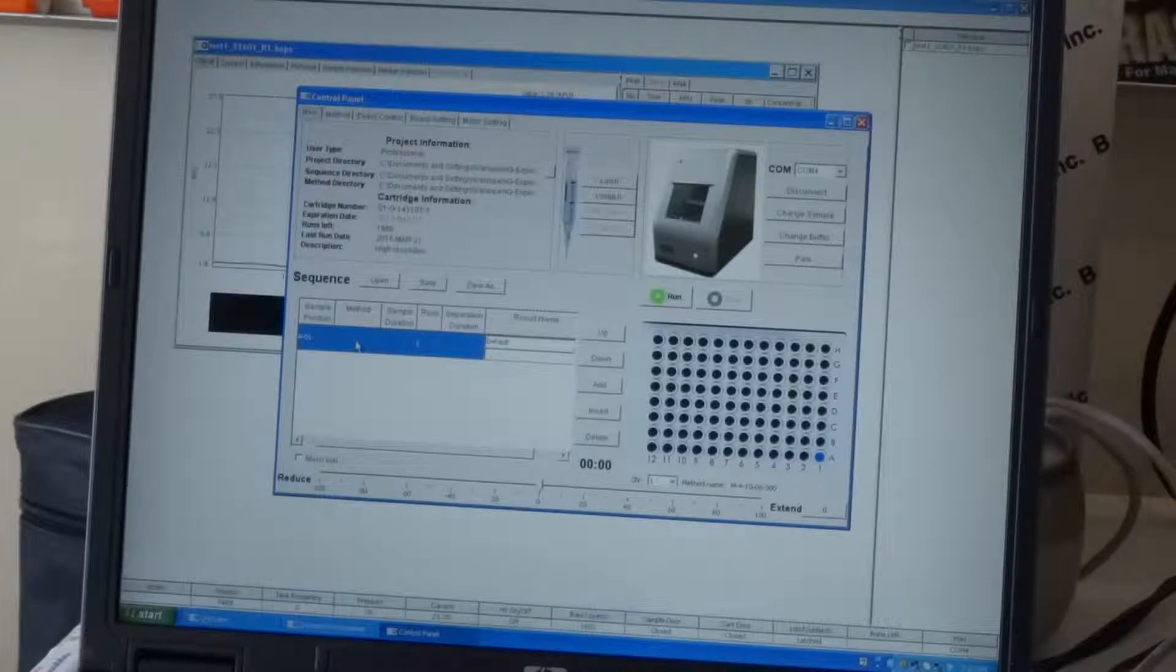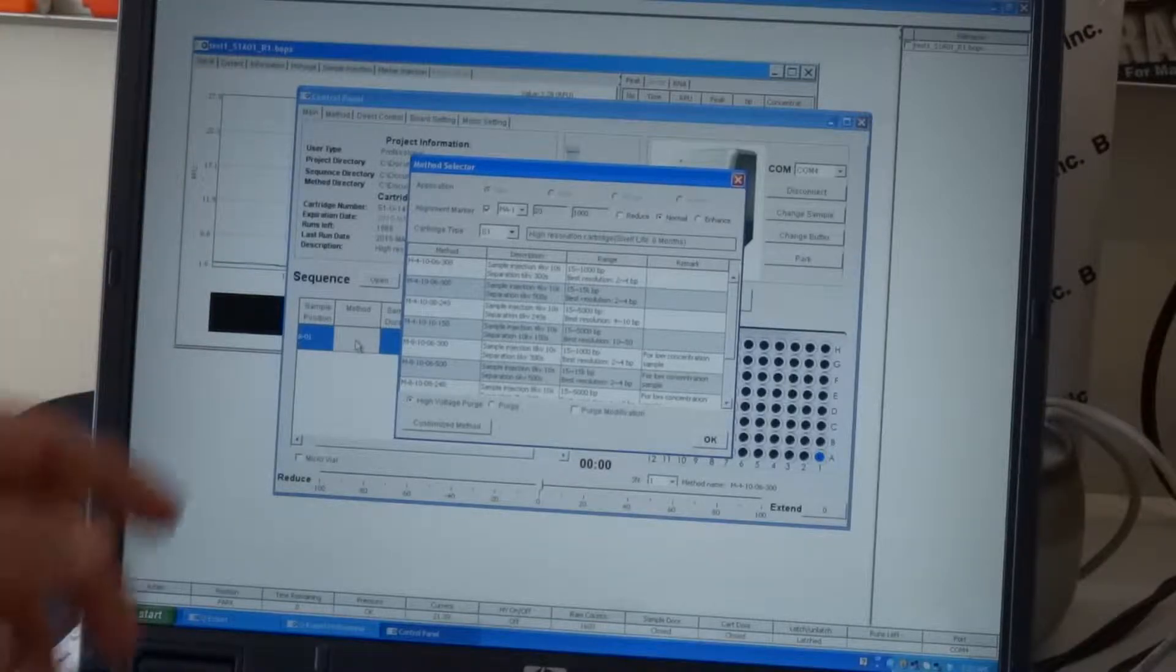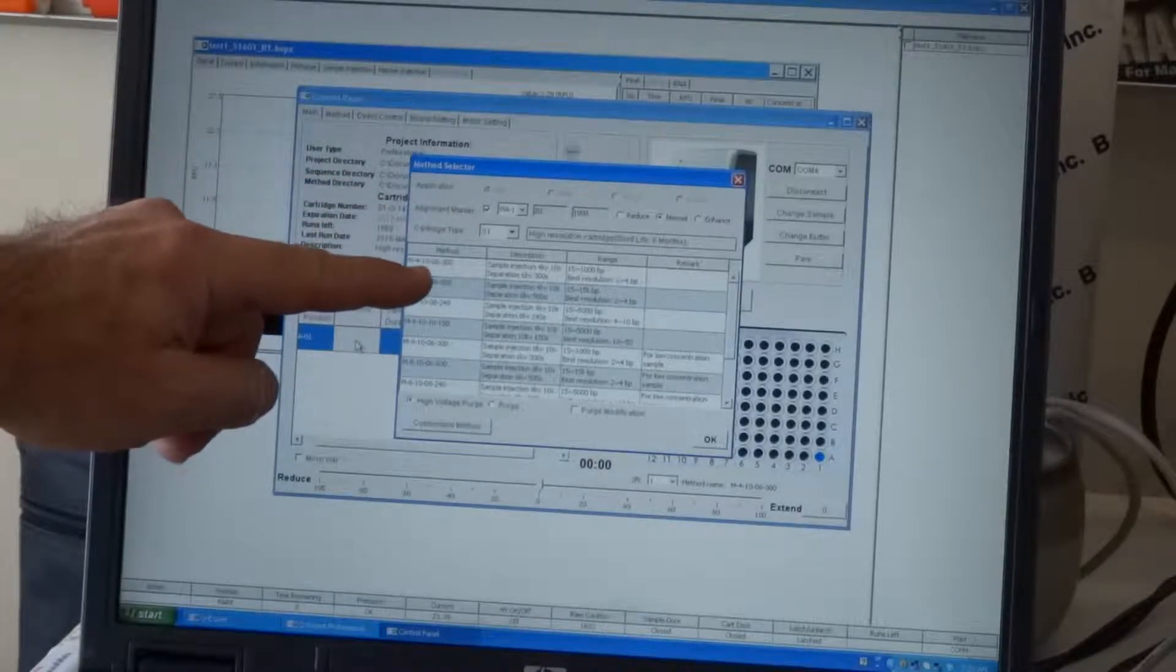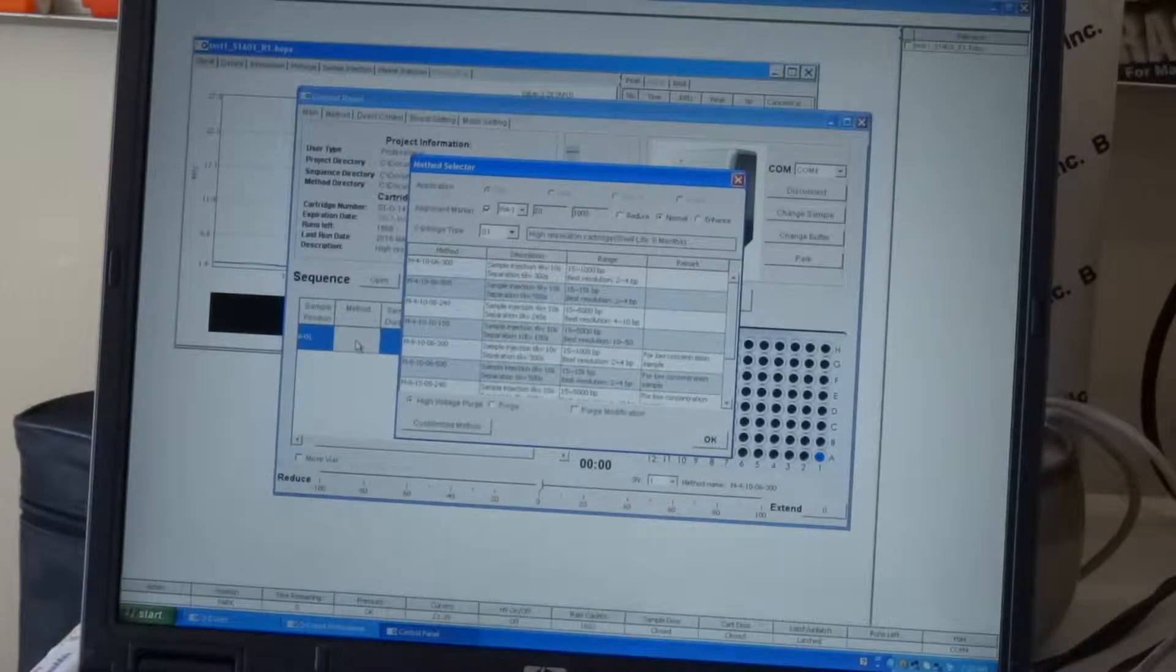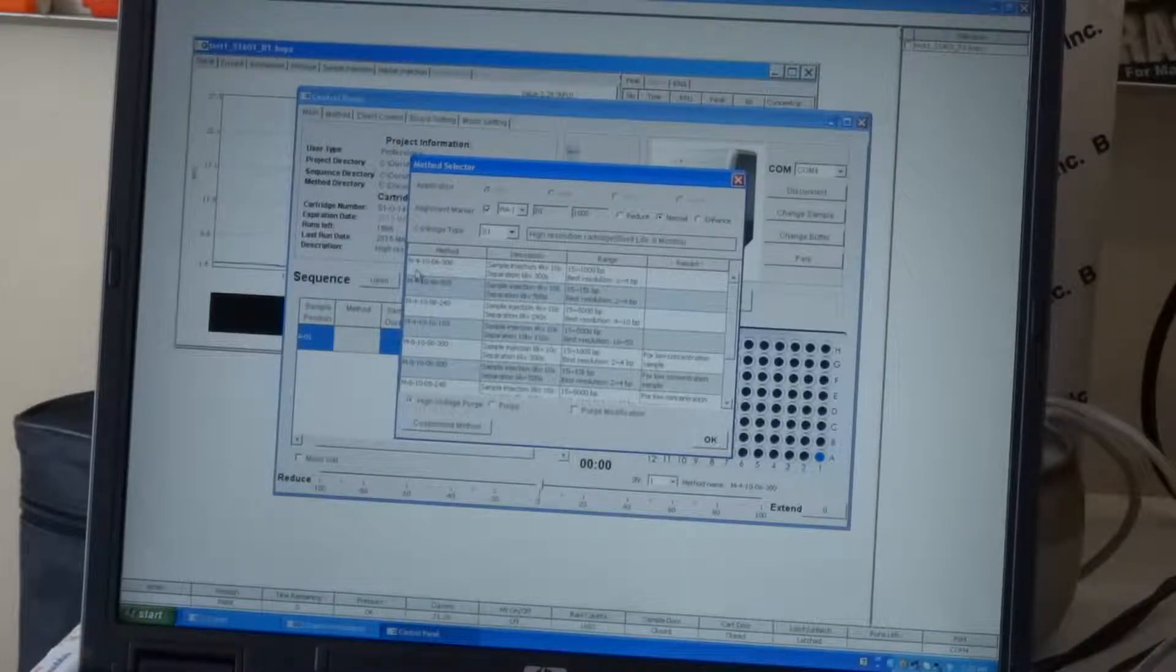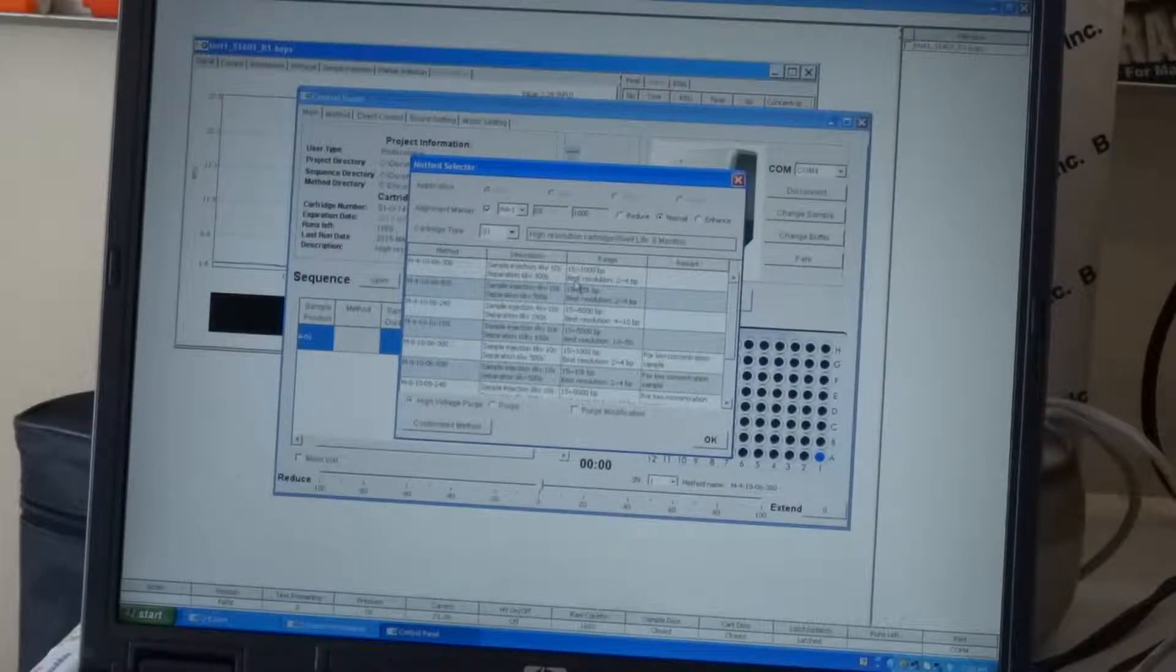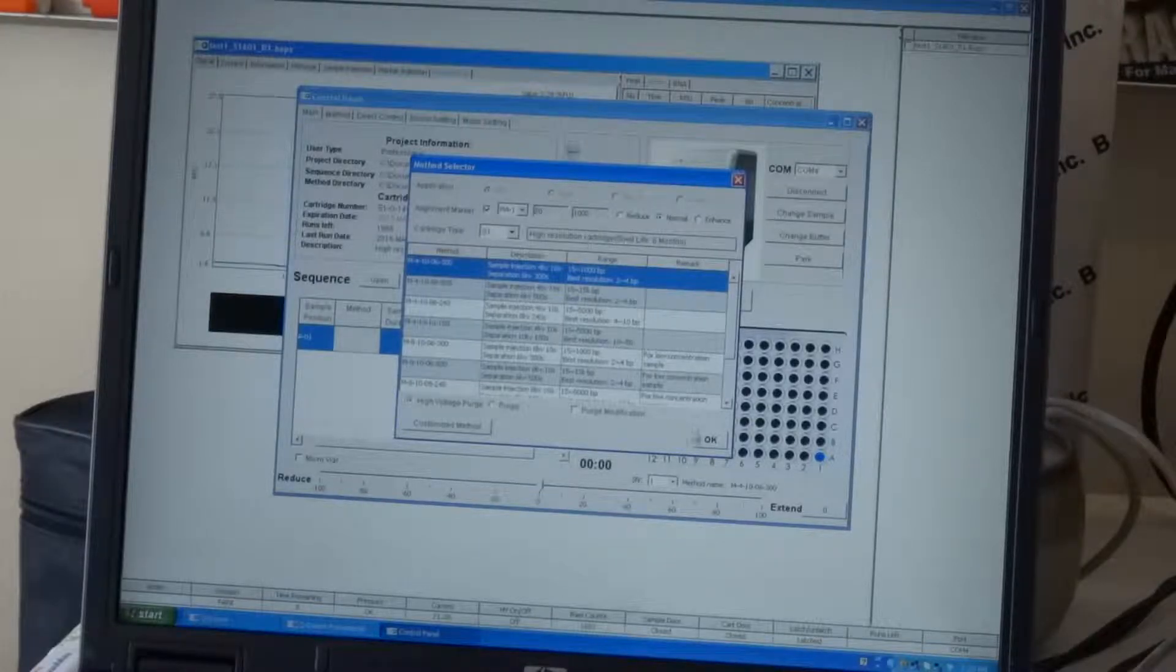So again, to select a method, the methods are basically picked up by the RFID chip for this particular cartridge, which is an S1 cartridge. And it will say what kind of resolution, what kind of speed, what kind of voltages you want to run. Typically, you choose the first one, the M4 method. And it will run a separation at 6 kV for 300 seconds, and sample injection will be 4 kV at 10 seconds. This will resolve 2 to 4 base pair resolution.